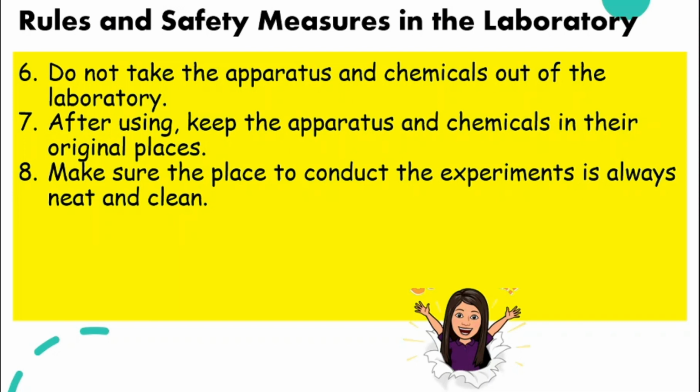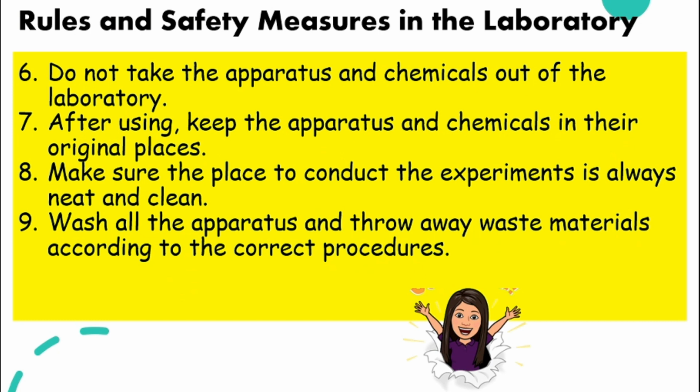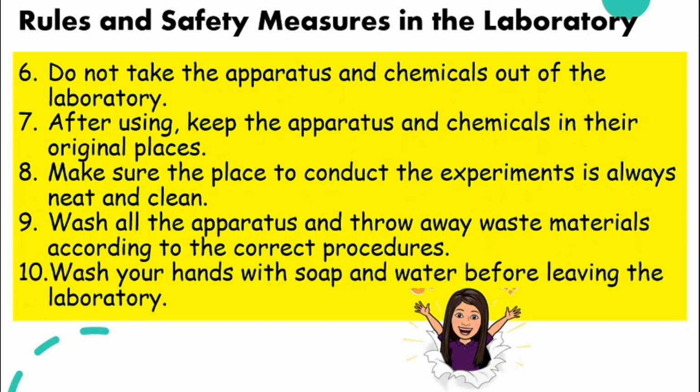Make sure the place to conduct the experiments is always neat and clean. Always tidy up your desk before you start the experiments in science lab. Number 9, wash all the apparatus and throw away waste materials according to the correct procedures, and your teacher will brief you on that. Okay, don't worry. Number 10, wash your hands with soap and water before leaving the science lab.